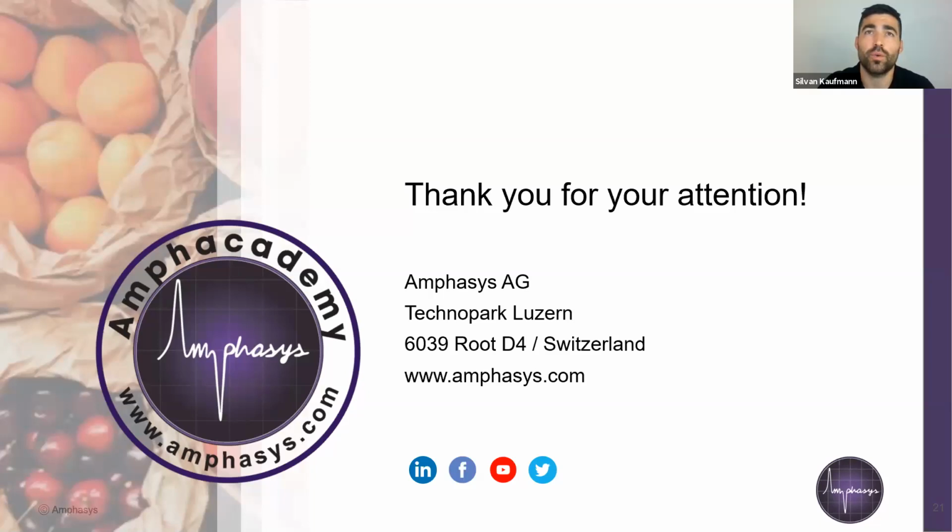Another question was whether we can share the design of the pollen traps. Yeah, of course, that's not a big deal. You can drop us an email and we can share the knowledge, and we can also tell you where we get it and how to prepare it, and then you can also order the counting buffer at the same time.